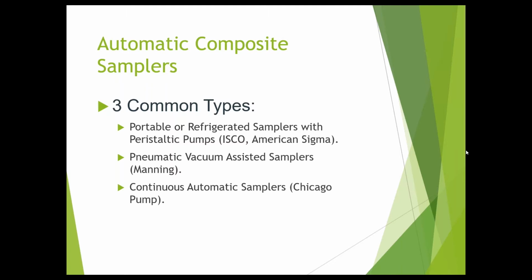So again, flow proportional sampling really should be based on application. It's not necessary at plants with uniform flow, unless they have swings in flow, and we're talking about really dead times or high I&I. Then you might need flow proportional. But to answer the user's question, if the plant was a batch reactor, something like that, and I want to enforce the permit, then I'm definitely going to follow the permit to give my case the best possible chance in court.